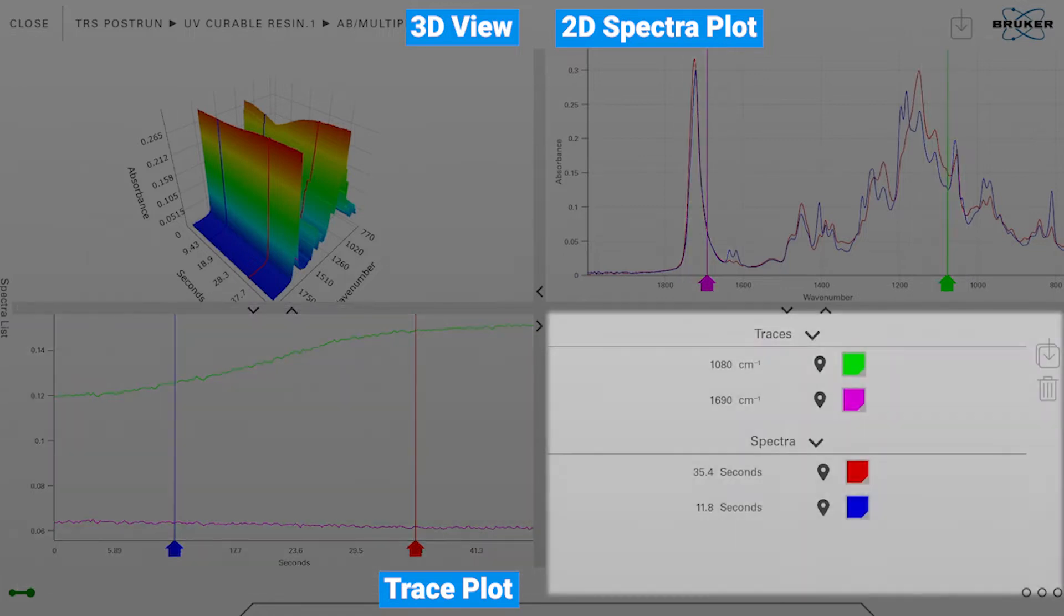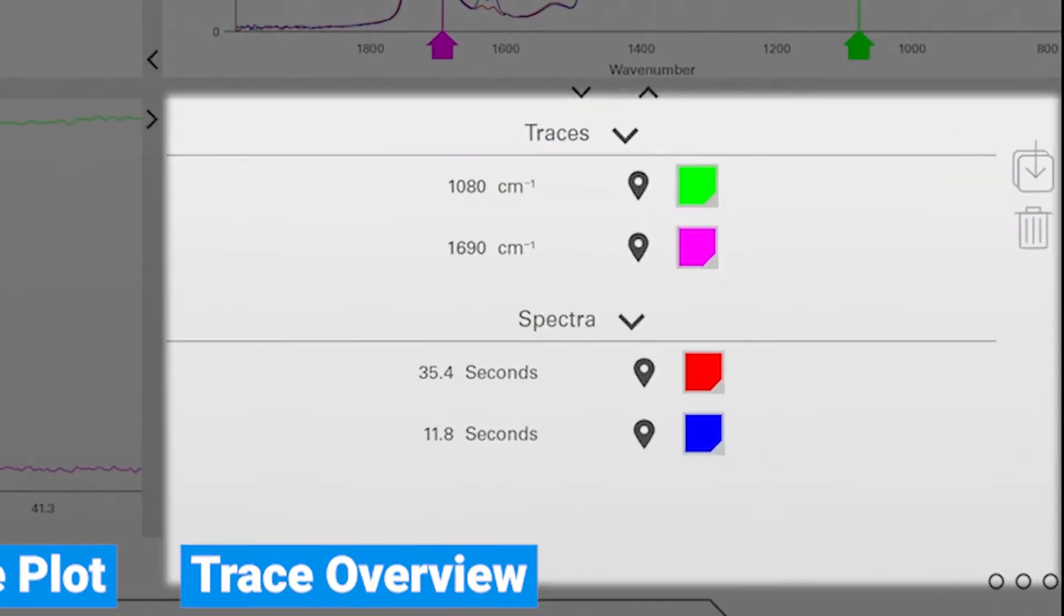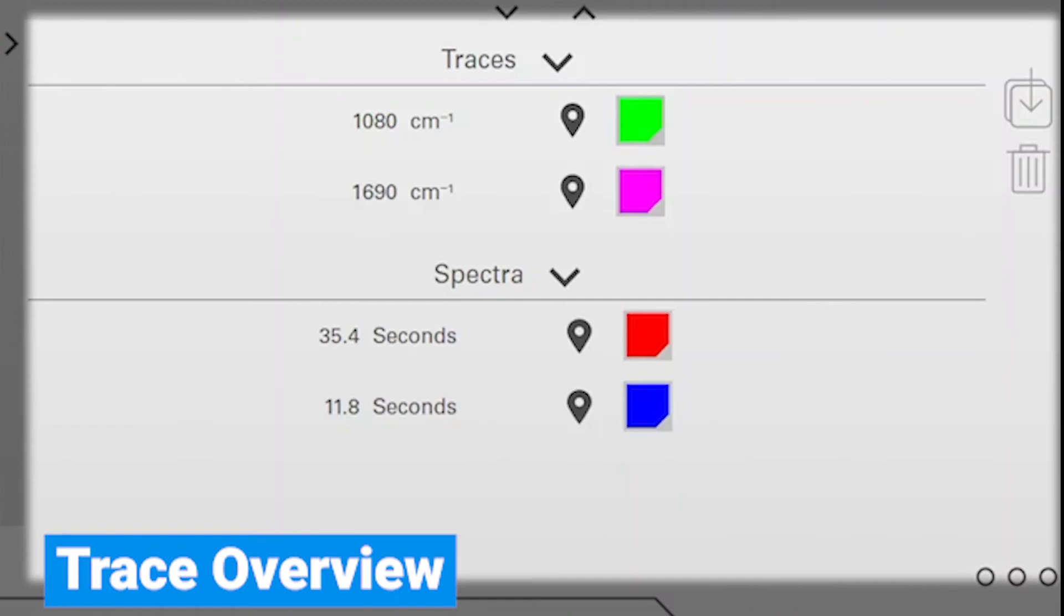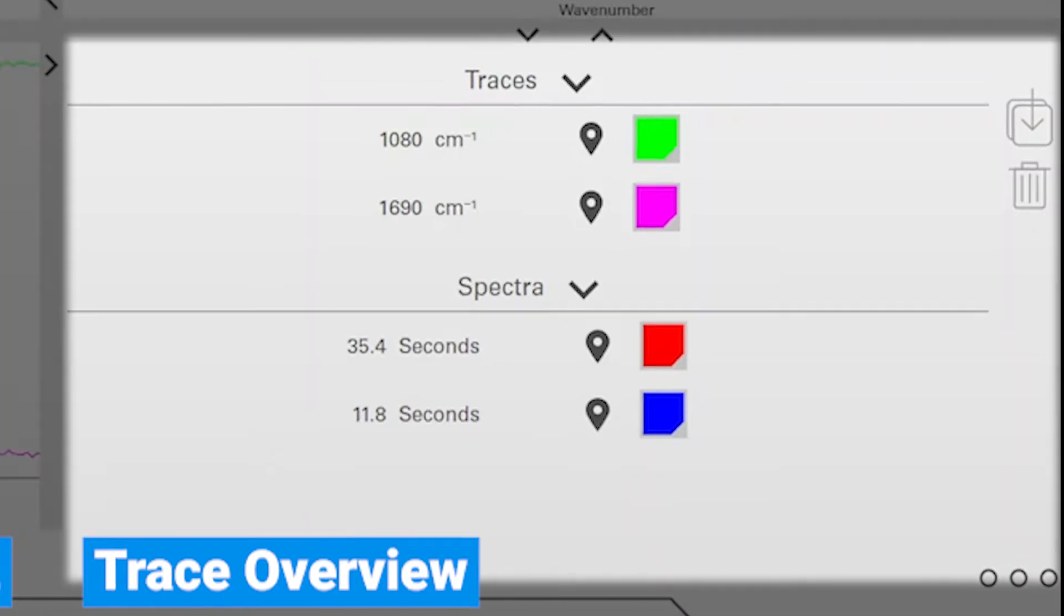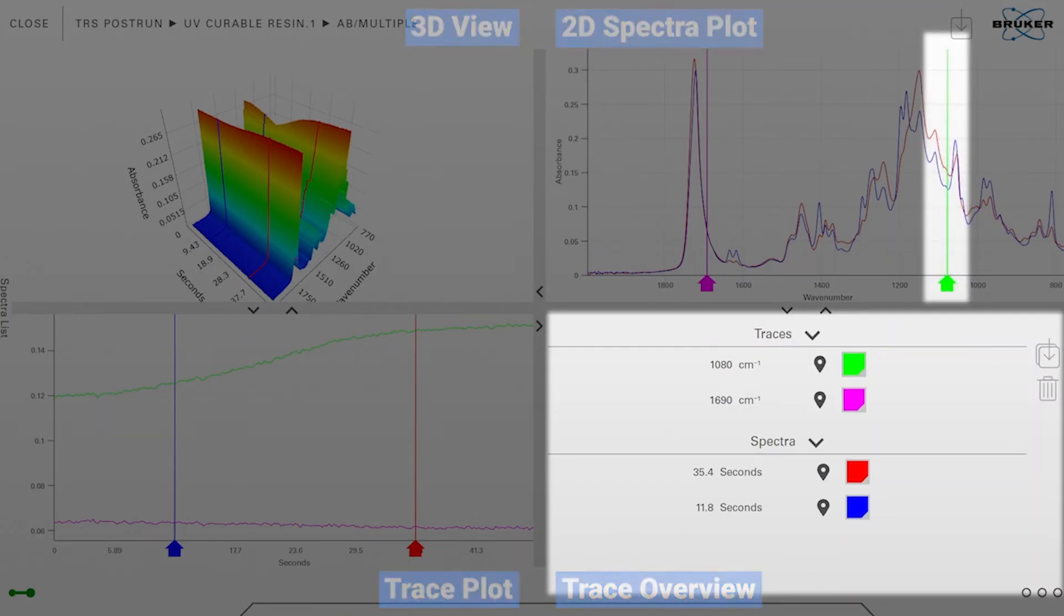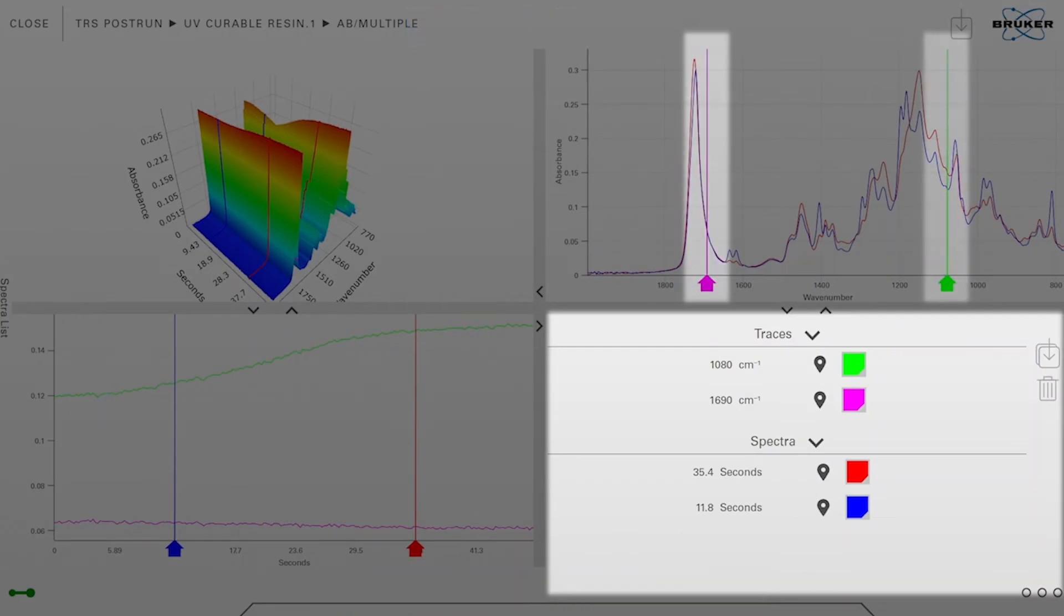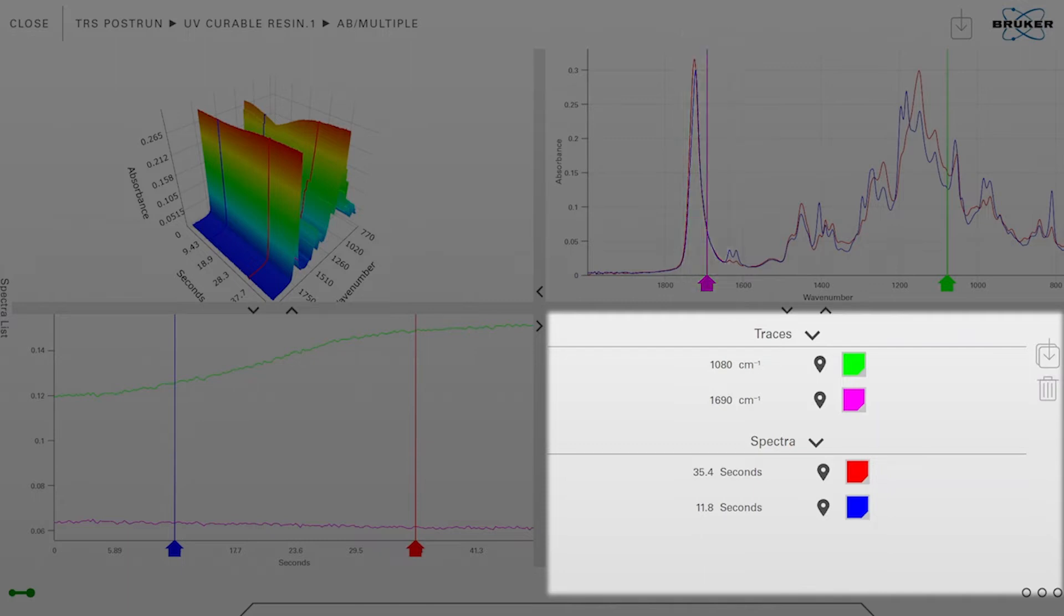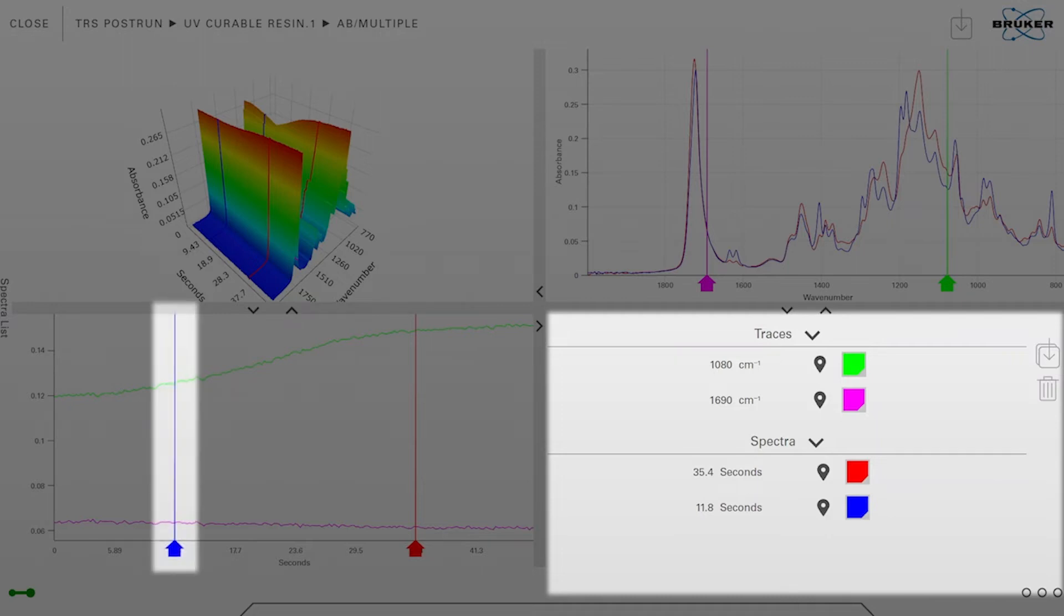On the lower right corner we can see an overview of the traces which we have set. For example, the upper list shows the position of the green and pink colored markers. So the green one is at 1080 wave numbers and the pink one is currently at 1690 wave numbers. The lower list which is called spectra shows the specific time value where we have set the blue and red colored markers.